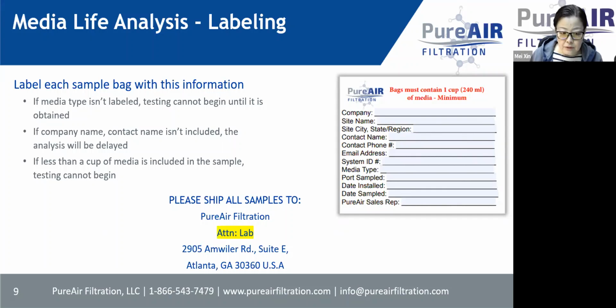And another thing critical is, please, when you collect a sample, please collect more than 1 cup if possible. That's normally the minimum amount needed for testing. And certain media, like for safety swab, maybe you need 2 cups. So if you can get more, that's better.